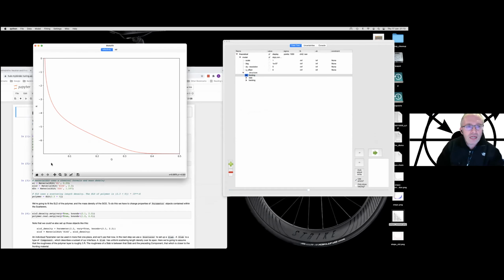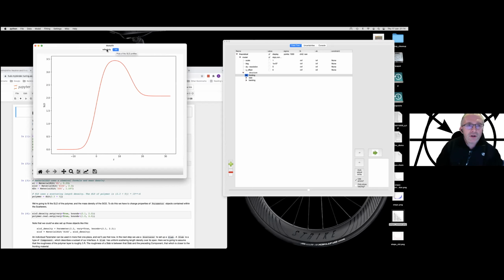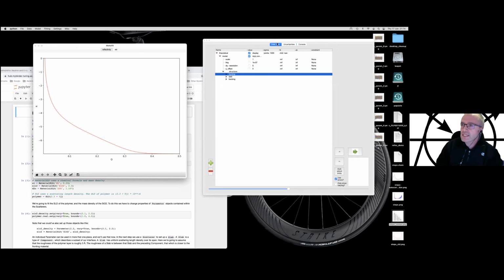In the graph, you've got reflectivity as a function of Q. You can fit as ln R versus Q, log R versus Q, RQ to the 4 versus Q, or RQ squared versus Q. In the command line context, you can give it any transform you want if you don't like those, like fitting of R over RF or something along those lines. So we've got the reflectivity graph, then the SLD profile. Let's load a data set. I grab the data set, here's one I made earlier, just drop it onto the graph and it populates the graph.